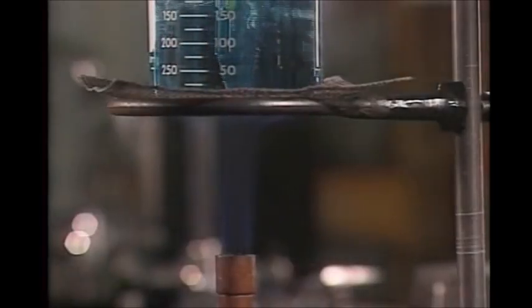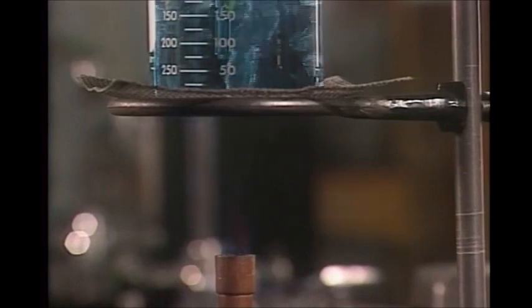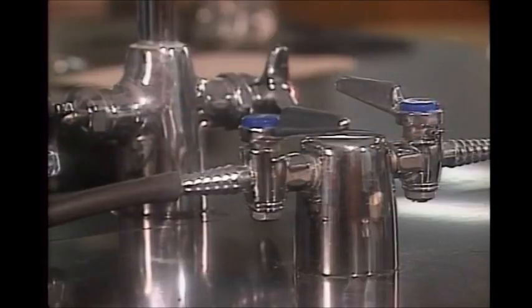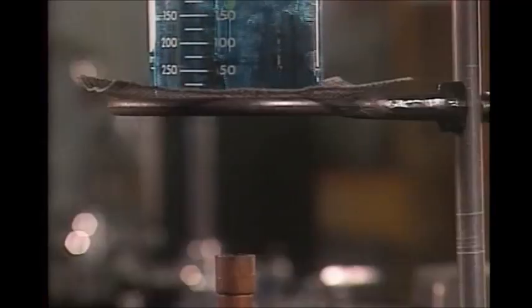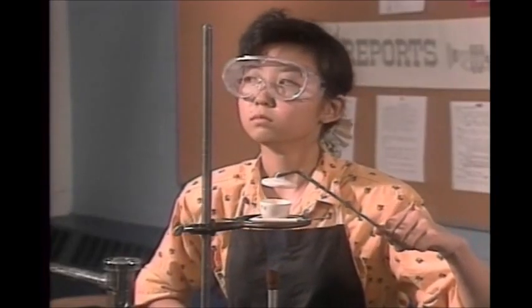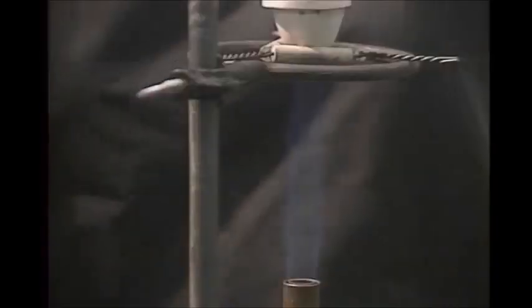If the flame begins to sputter or flare, turn the gas off immediately. Also turn the gas off immediately if the flame goes out. Unburned gas escaping into the room could ignite and cause an explosion. Even when the burner seems to be working properly, if you smell gas, turn it off.